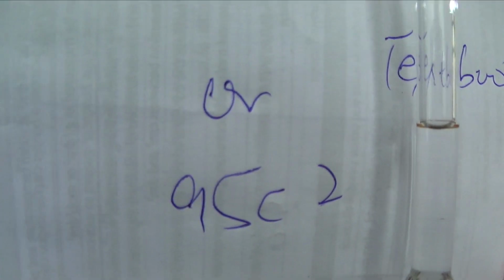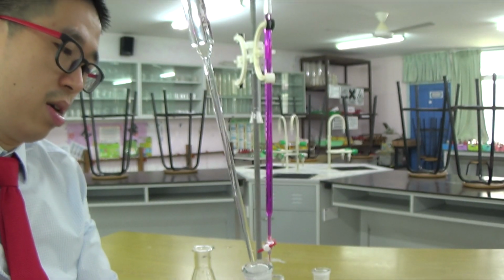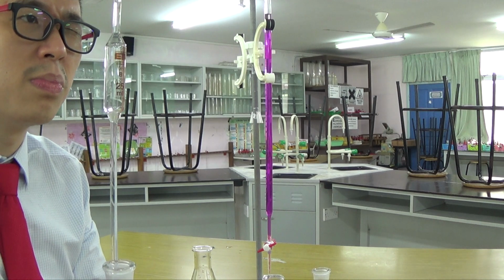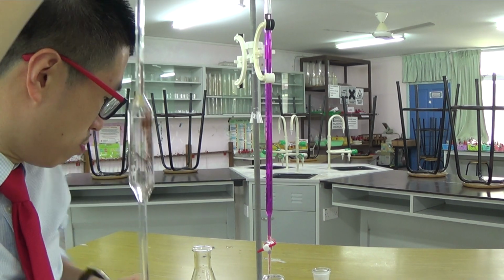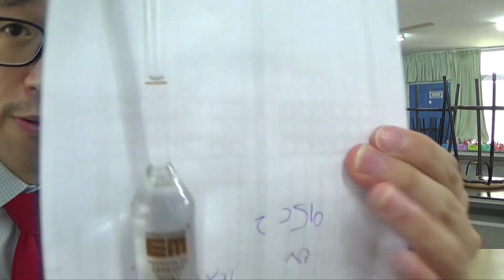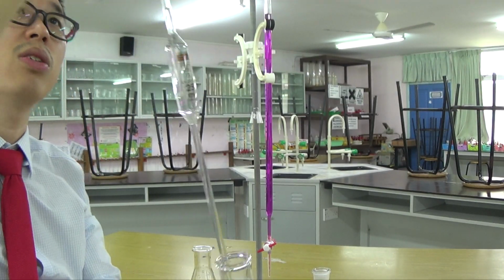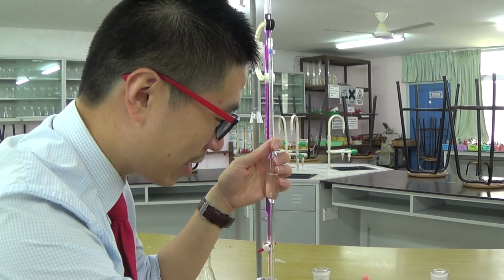So below the meniscus you can see I think it got a bit of air bubble, but I think you should probably check a bit more, suck a bit more. That should do the job, I believe. So there's 25 ml there, 25 cm3 from this 25 ml pipette. So eject it out into the conical flask. We're ready for our second exact titration.